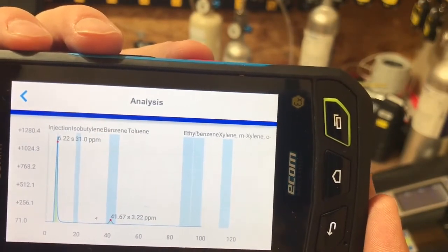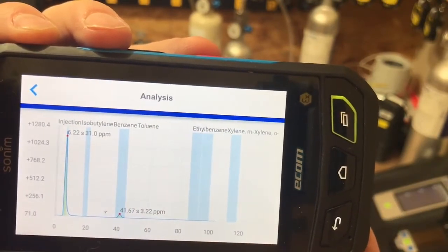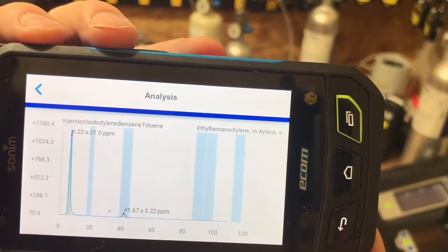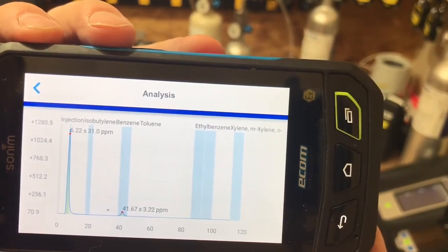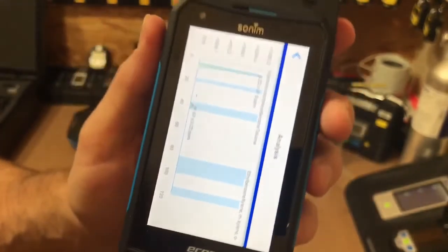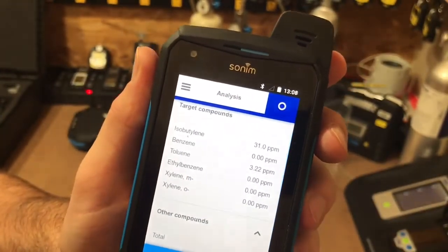Probably crop this video out a little bit to save you some time, but coming up on the xylenes at the end — for 120 seconds, there shouldn't be any xylenes in this, we would hope not again. Let's flip this back, go back to the analysis mode, come up and see what we started reading.